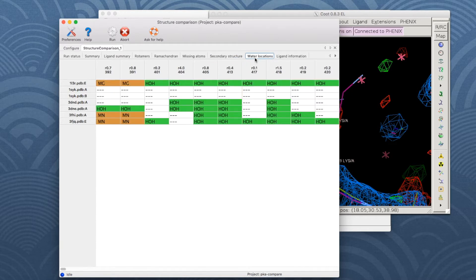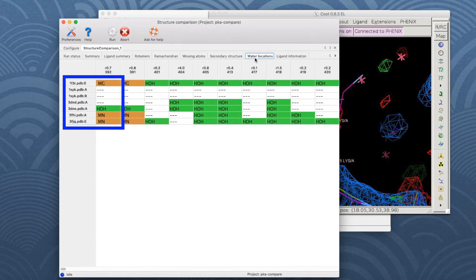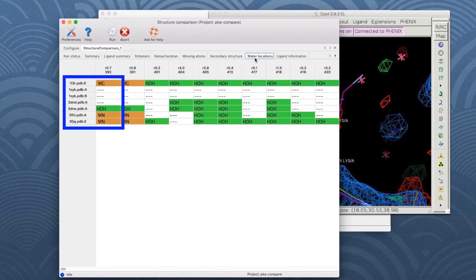The water results table lists water molecules and ions which are not conserved in all chains. For example, the first column shows that there are a magnesium ion, two manganese ions, and one water molecule at equivalent positions in four of the chains while there is no water in three of the chains.